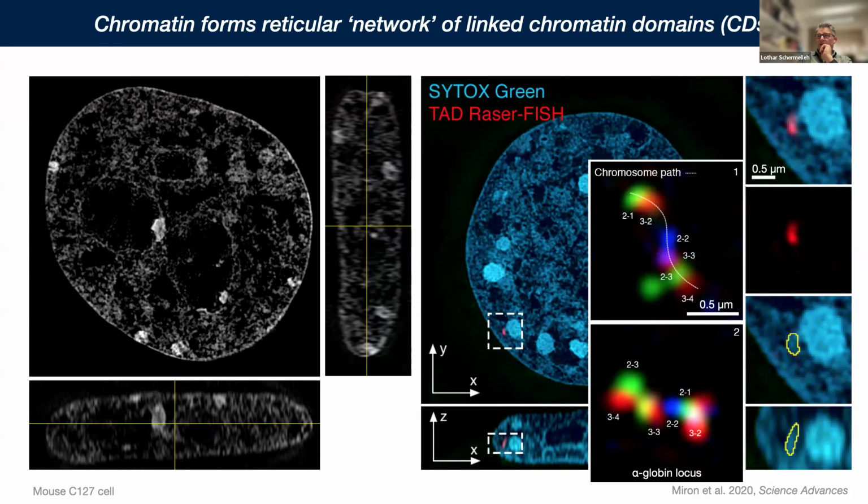If we label consecutive domains that have been identified as TADs based on Hi-C maps, you can see curvilinear paths of domain features, but sometimes domains also build up a larger blob, or sometimes a domain may divide into two blobs and so forth.